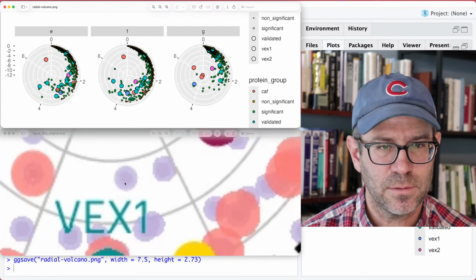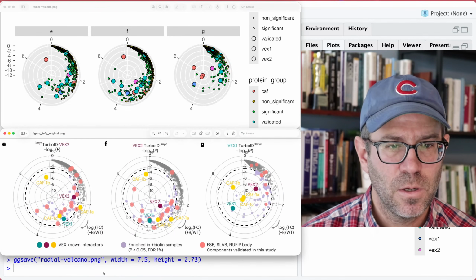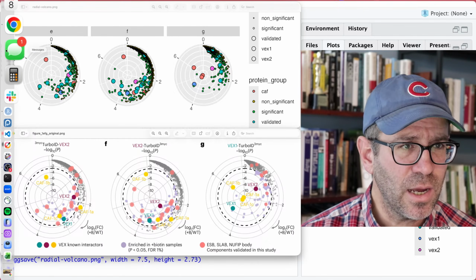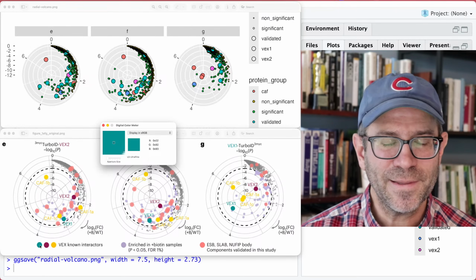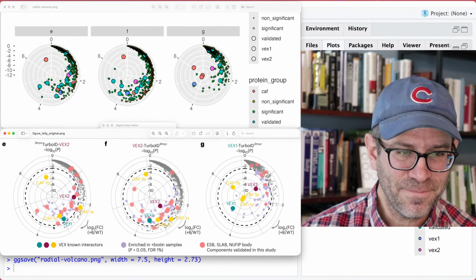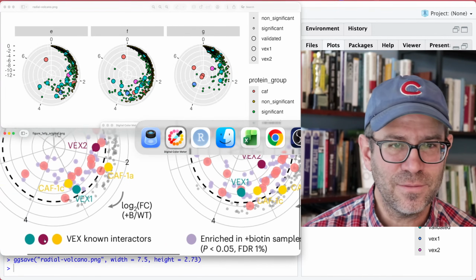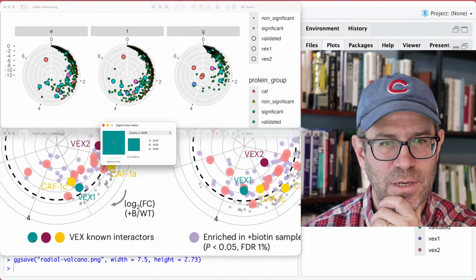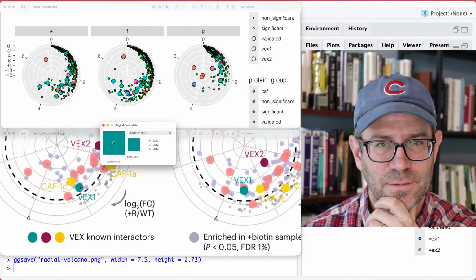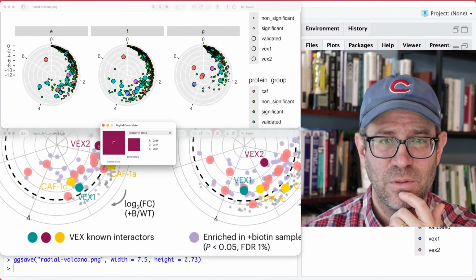Things are kind of compressed right now, but like I said, we'll come back to that. So let's get the color right. And so I have my handy dandy color monitor. And one thing that I've noticed, if I zoom in on these, is that the colors that are in the legend are not the same as the colors in the plot. So this is like 02, 92, 93. Well, that's right. Let's see, this burgundy, 94, 16, 50, 95, 17, 52, right?